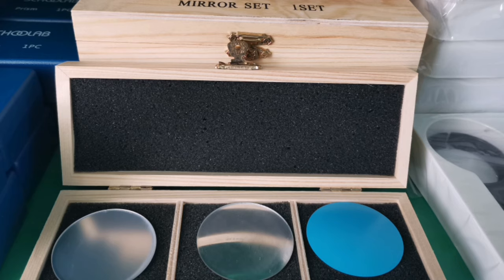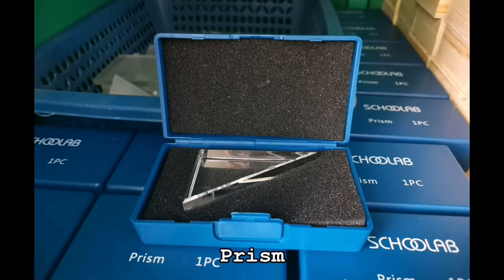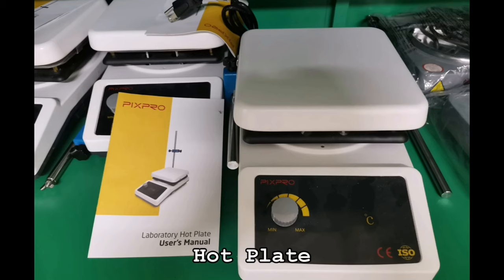A prism is a transparent, geometric, optical object with a minimum of two polished plane faces inclined relative to each other. Scientific hot plates are generally used to heat samples in glass beakers, flasks, vials, bottles, and other vessels.